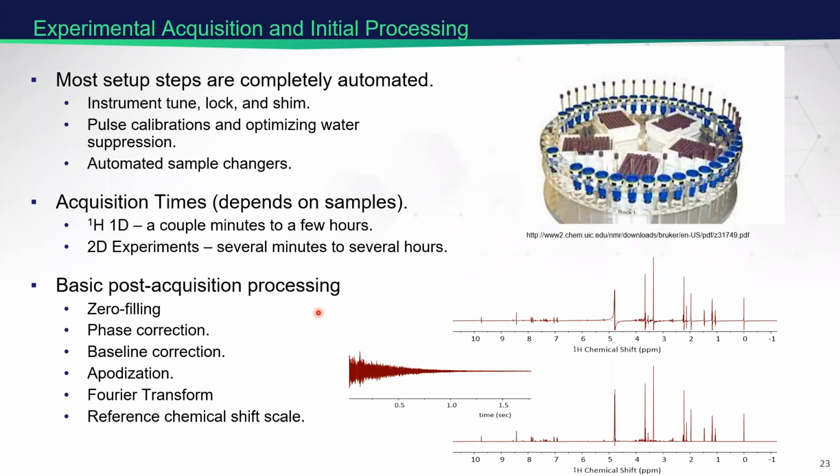So once the signal is acquired, we need to do some things to convert it into a form that is more interpretable by us. And so I've listed some steps that we do to do that. I think some of these steps will be highlighted in more detail later today during the data analysis or data processing talk.